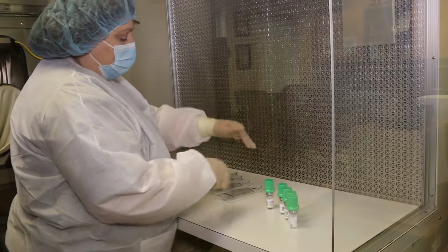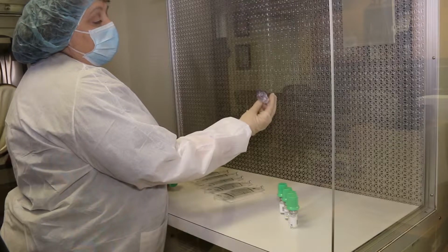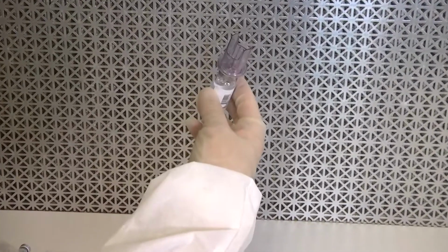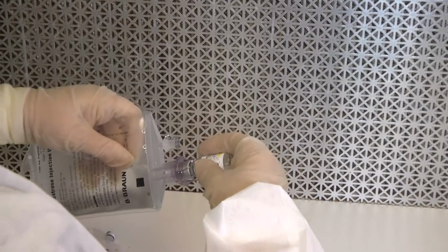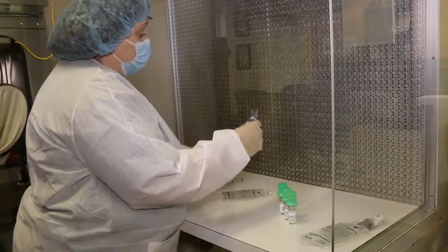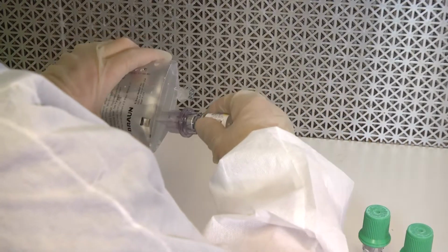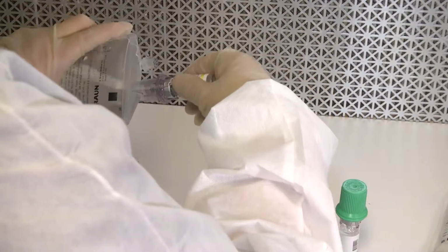And again, we can't turn the IV this way because once I remove this, in there you see a needle, and that needle has to remain in the sterile airflow. So I will take the bag and attach it. It's attached, ready to go. But again, it is not being contaminated, not being shadowed. It is just being attached with the airflow in front of us. Once it's attached, you can turn it any way in the hood because the critical sites are not exposed any longer.